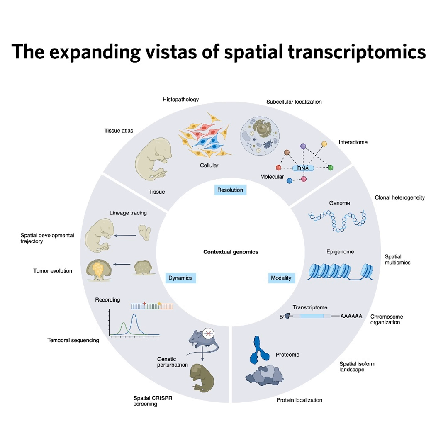Each primer is tagged with a unique location-identifying barcode, like a tiny little zip code. Okay. Then you place the tissue section on top of this surface. The RNA molecules diffuse out of the cells, get captured by these primers, and become tagged with that location-specific barcode. Then you collect all that RNA, sequence it, and the barcode tells you where each RNA molecule originally came from. Got it. So SST is kind of a catch-and-sequence approach. You capture the RNA, tag its address, then read it all out digitally later to build the map.